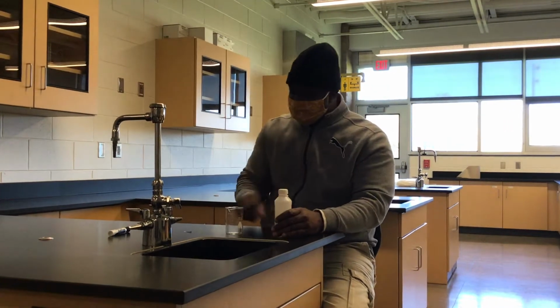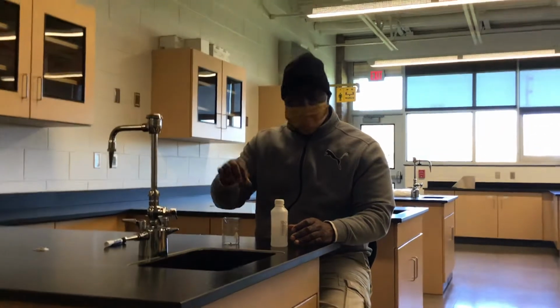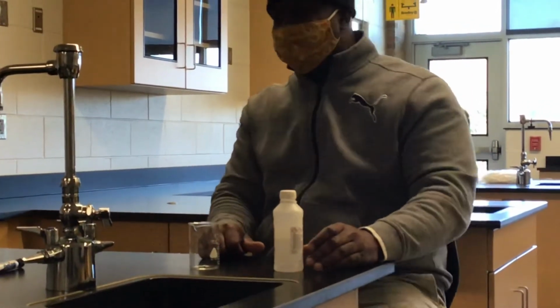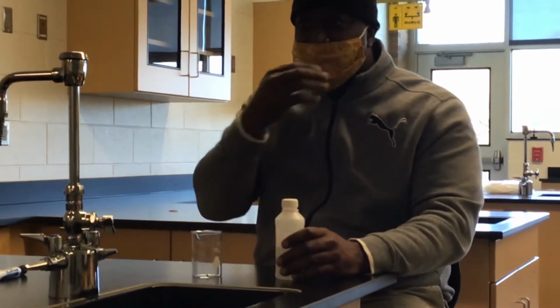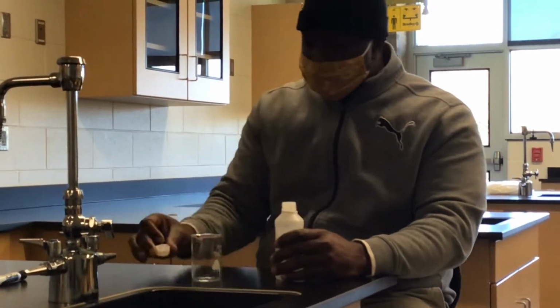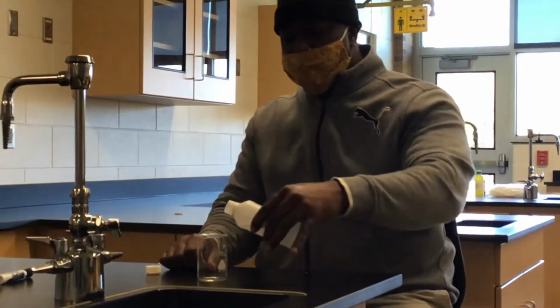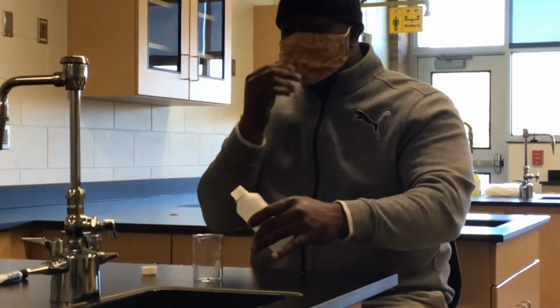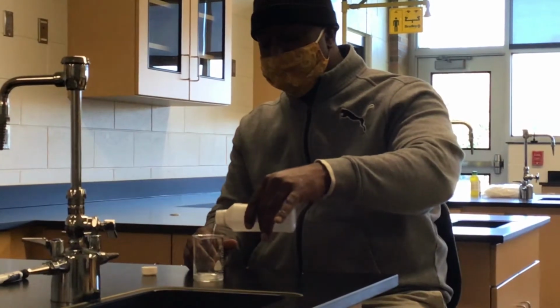Before you were here, I carefully measured exactly 0.32 grams of magnesium. It's magnesium wire, 0.32 grams of magnesium. Write that down. The reason we need to write that down is because that is a known. Right here, I'm going to use hydrochloric acid. You would not touch this, you would not breathe this because it's toxic. Also found in your stomach.